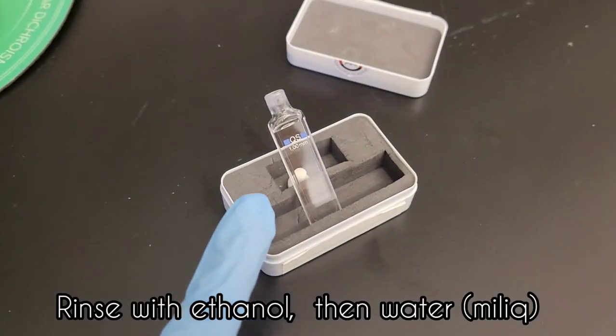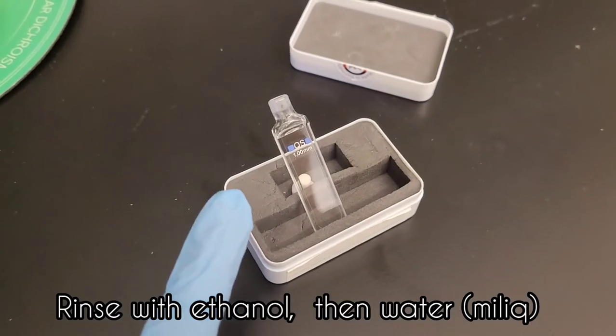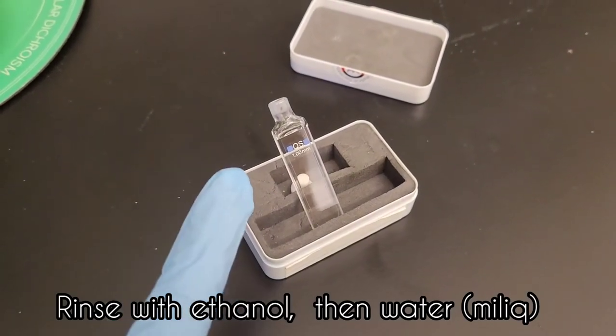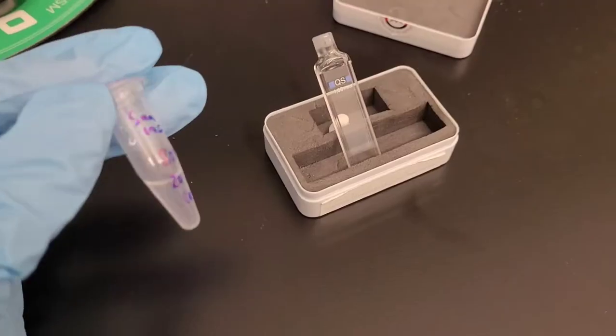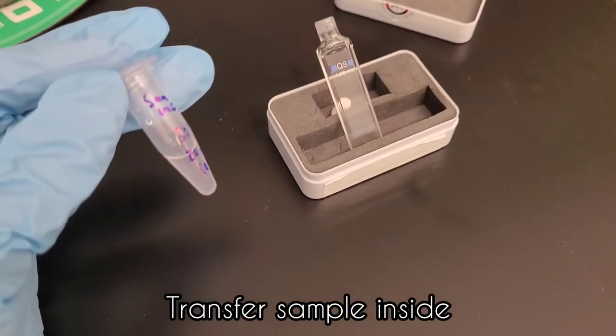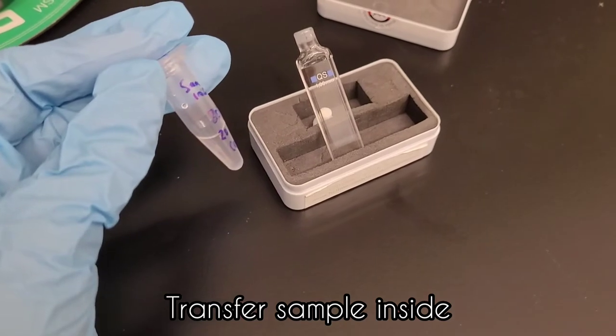You want to rinse your cuvette with ethanol, then water. Then pipette your sample into the cuvette.